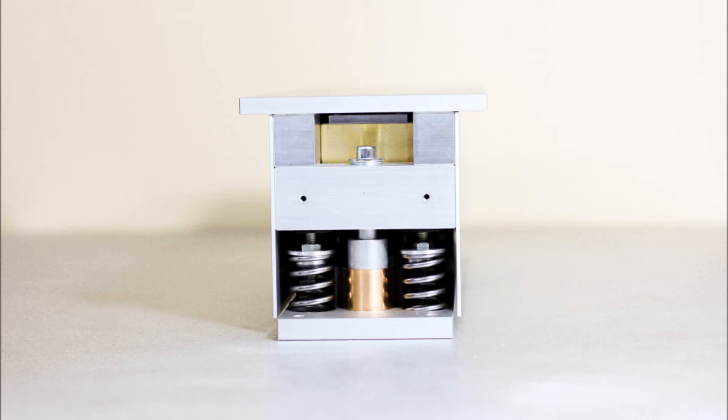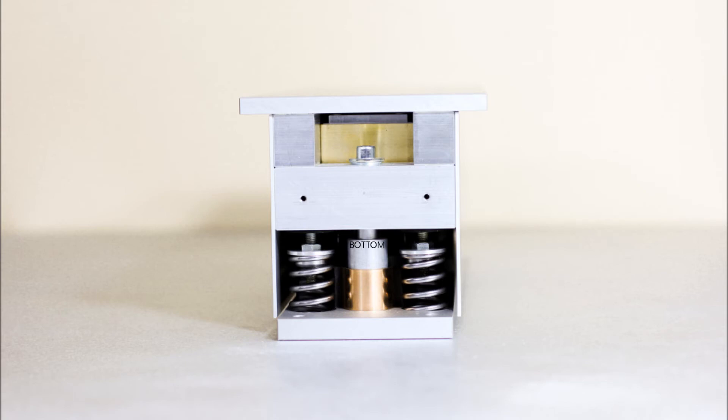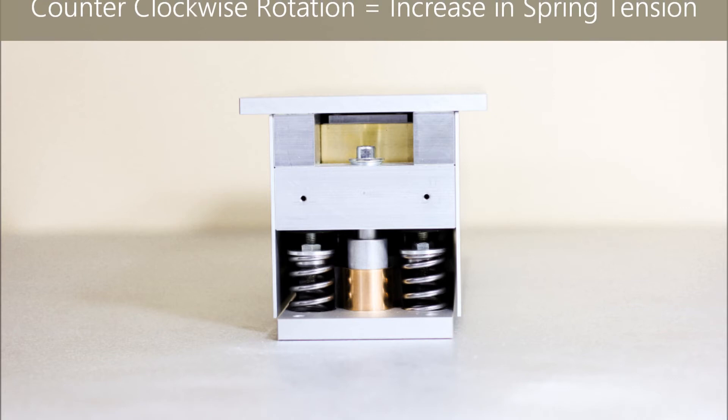If the crossbar is too high and is resting at the top of the central column, you'll need to decrease the spring tension by rotating the adjustment nut clockwise. If the crossbar is too low and is resting at the bottom of the central column, you'll need to increase the spring tension by rotating the adjustment nut counterclockwise.